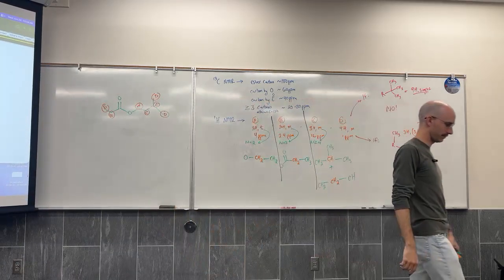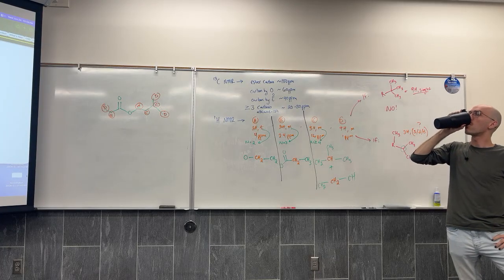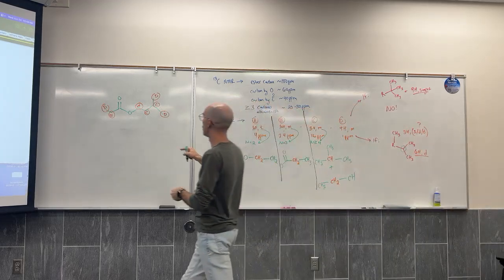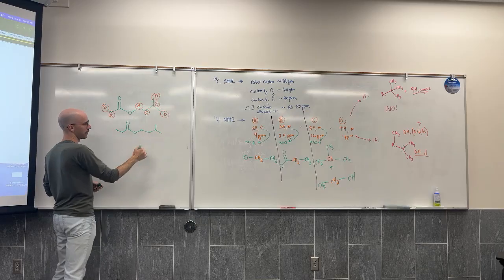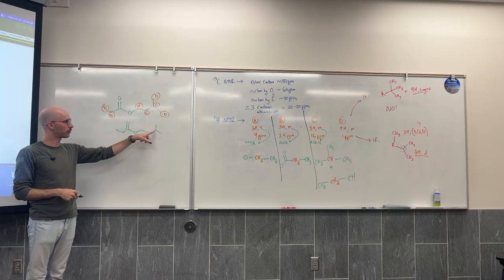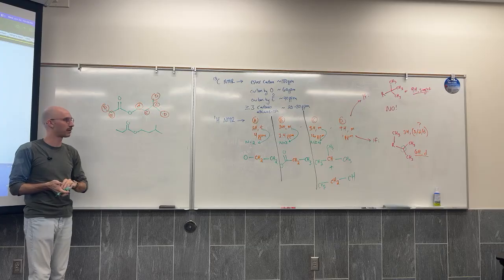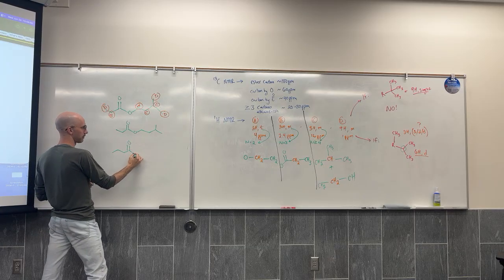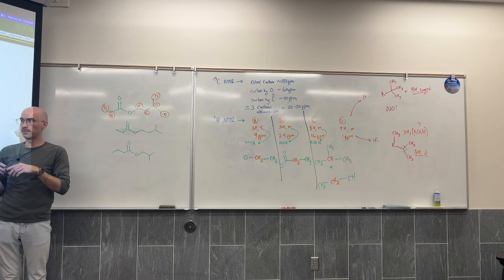I was looking it up and I think it could also be isobutyl butyrate. Potentially? Do you think? So here's what we just drew was isopentyl butyrate. Remember, iso's always got that little like peace sign at the end of it. 1, 2, 3, 4, 5 carbons, pentyl, with an iso distribution, isopentyl. And you're saying isobutyl butyrate. It was isobutyl butyrate, yeah. Isobutyl butyrate, put it on the other side.